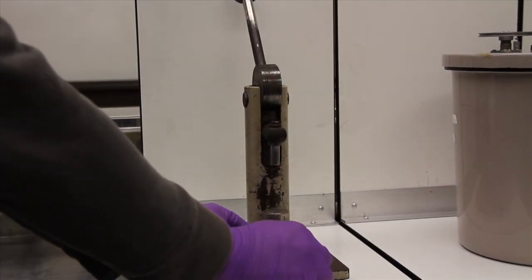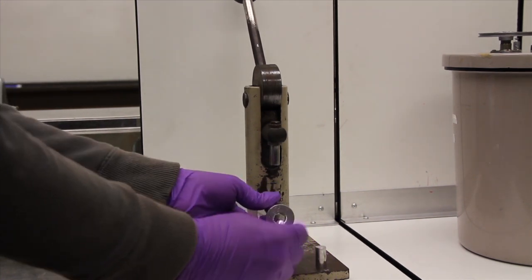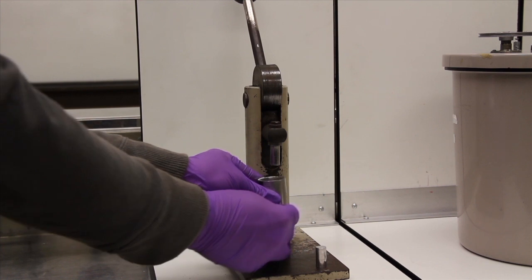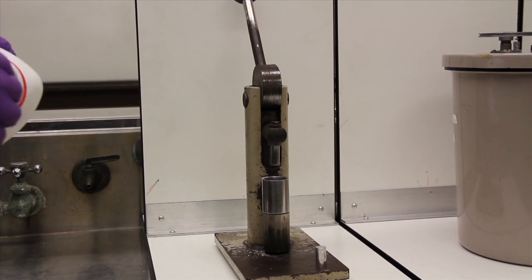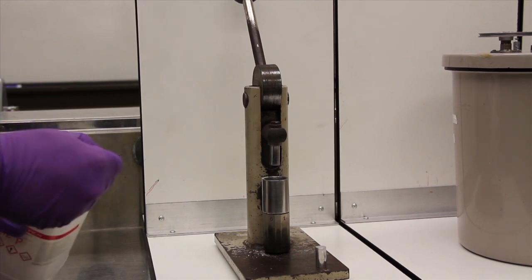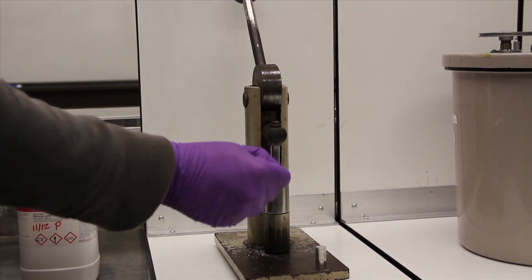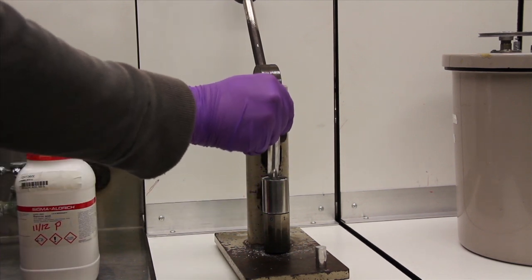In preparing a sample for analysis via bomb calorimetry, a press is used to generate a solid pellet from a powder. Prepare the pellet press by placing the solid end of one cylinder face up in the bottom of the press. Then load approximately one gram of the sample into the press.